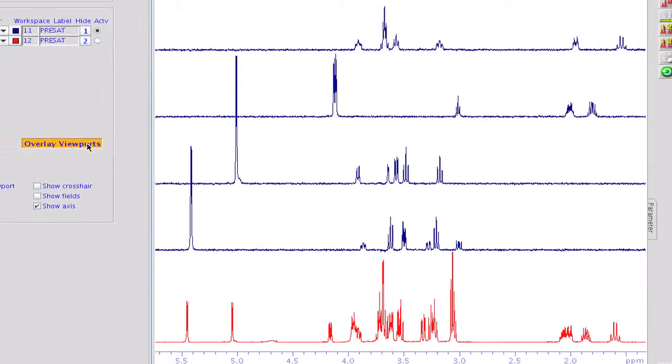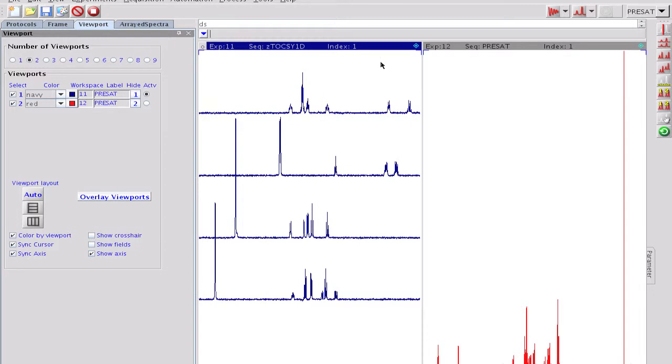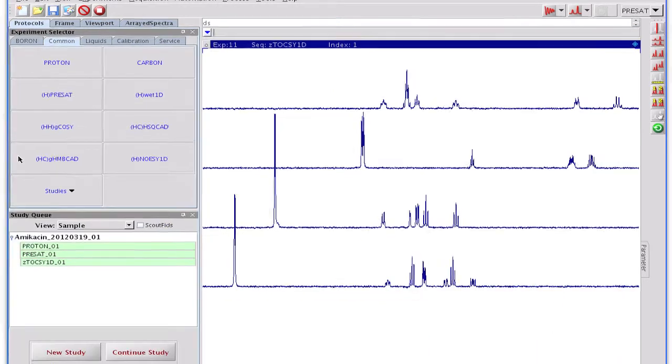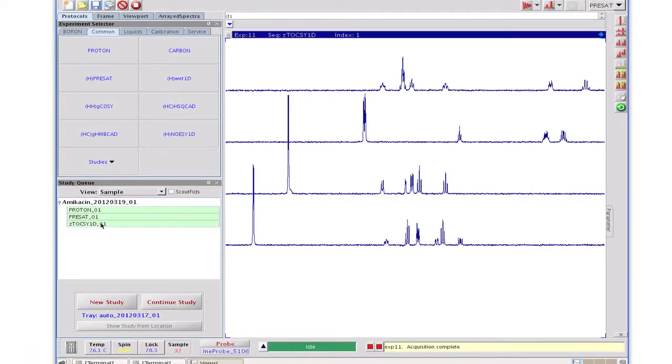During the setup procedure, we have seen that the mixing time can be arrayed. A selective 1D z-toxy experiment has been recorded with this option in advance, concentrating only on the low-field anomeric sugar proton at 5.5 ppm.